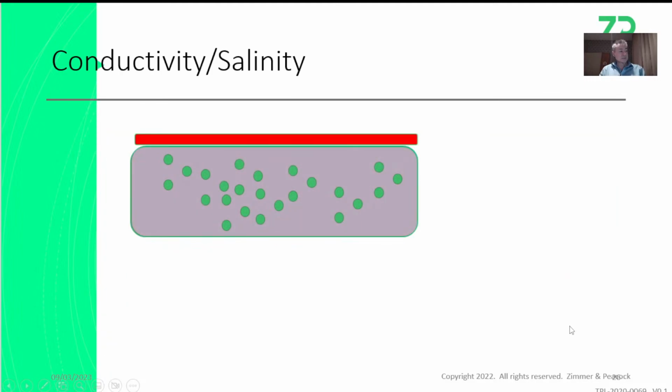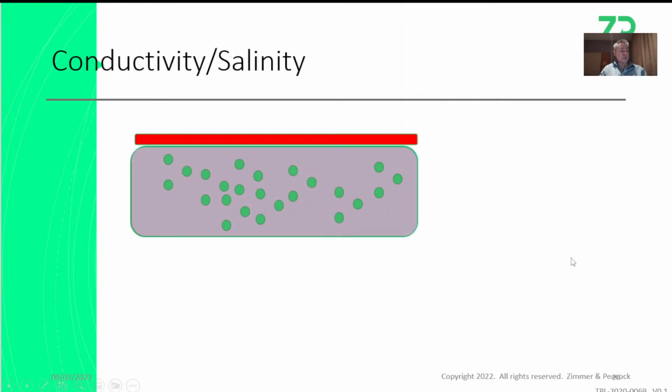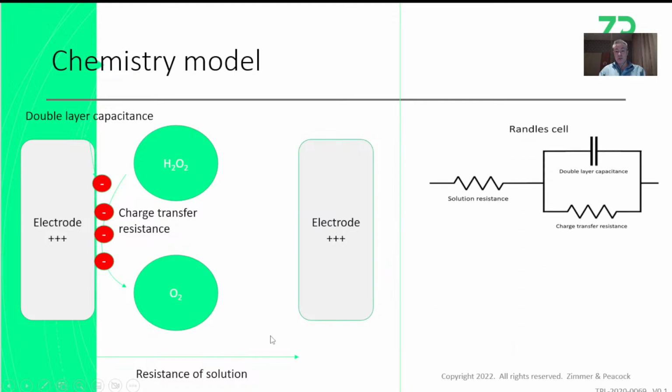Now, in terms of conductivity, I'm not entirely certain that the conductivity would change that much, but it can be measured. So I've made a little bit of a model here of the solution that you've treated. When you're measuring conductivity, you essentially have 2 electrodes. When you've got 2 electrodes, you can then measure the resistance of the solution, which is what these people want to do. These slides are borrowed from the workshops I'll do today.